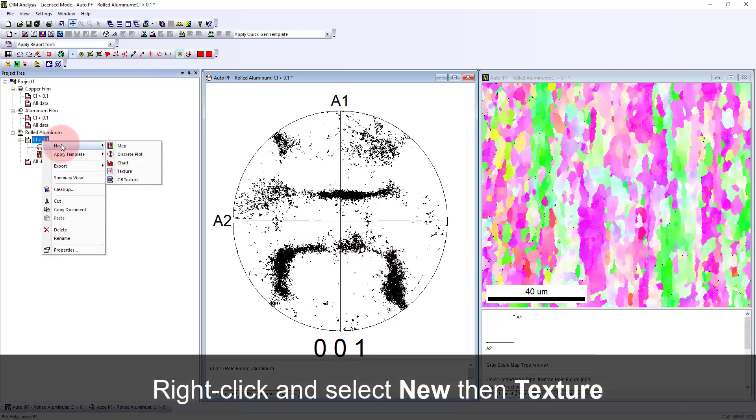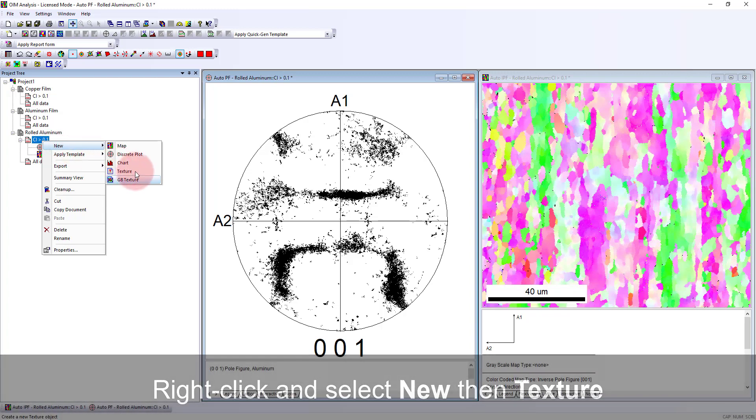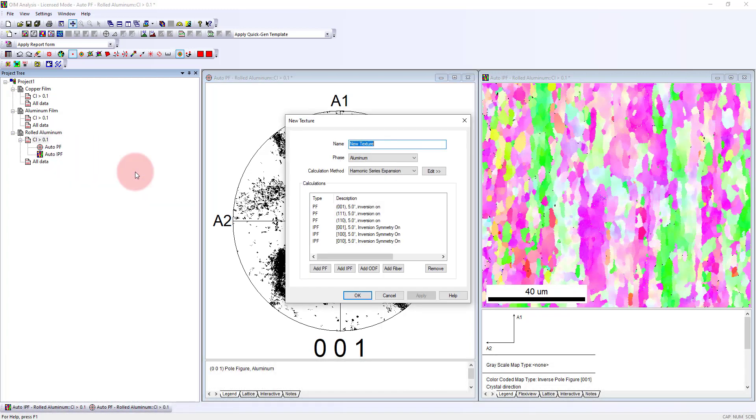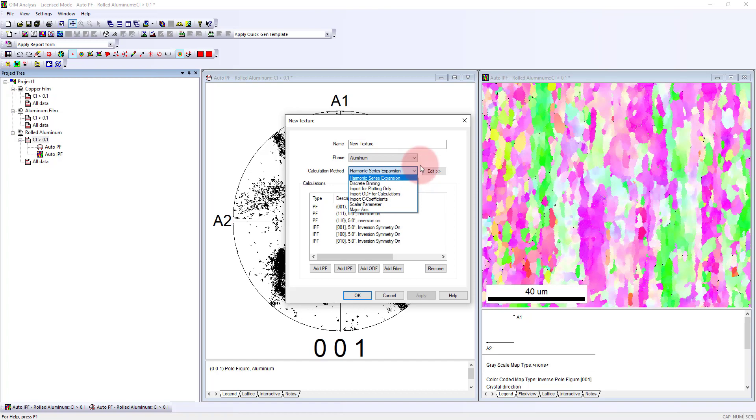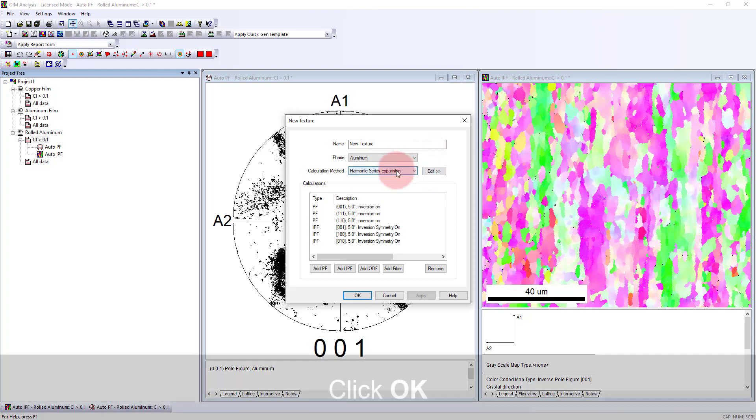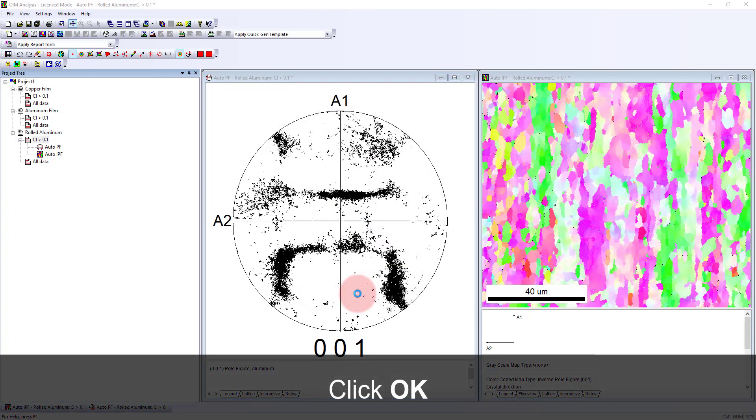We can do that by right-clicking here and saying let's create a new texture. By default, we're going to create three different pole figures: the 001 we've looked at, the 111, and 110 poles. It's also going to create some inverse pole figures. By default, when we do the calculation, we're using a harmonic series expansion. We'll click OK.